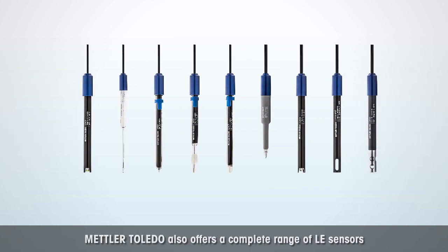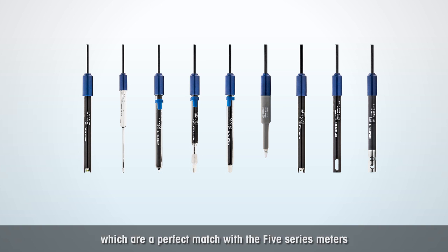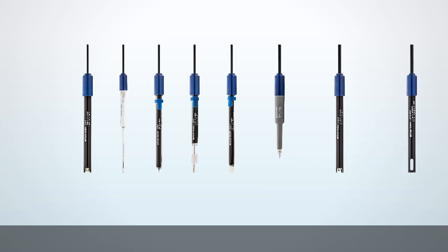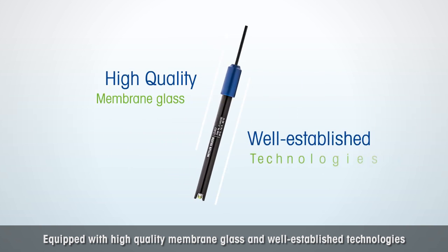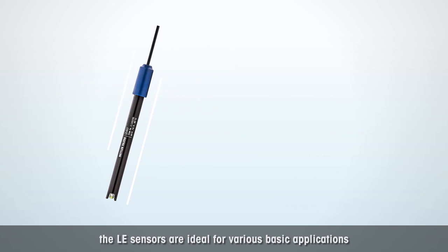Mettler Toledo also offers a complete range of LE Sensors which are a perfect match with the 5 Series Meters. Equipped with high quality membrane glass and well established technologies for trusted results, the LE Sensors are ideal for various basic applications.